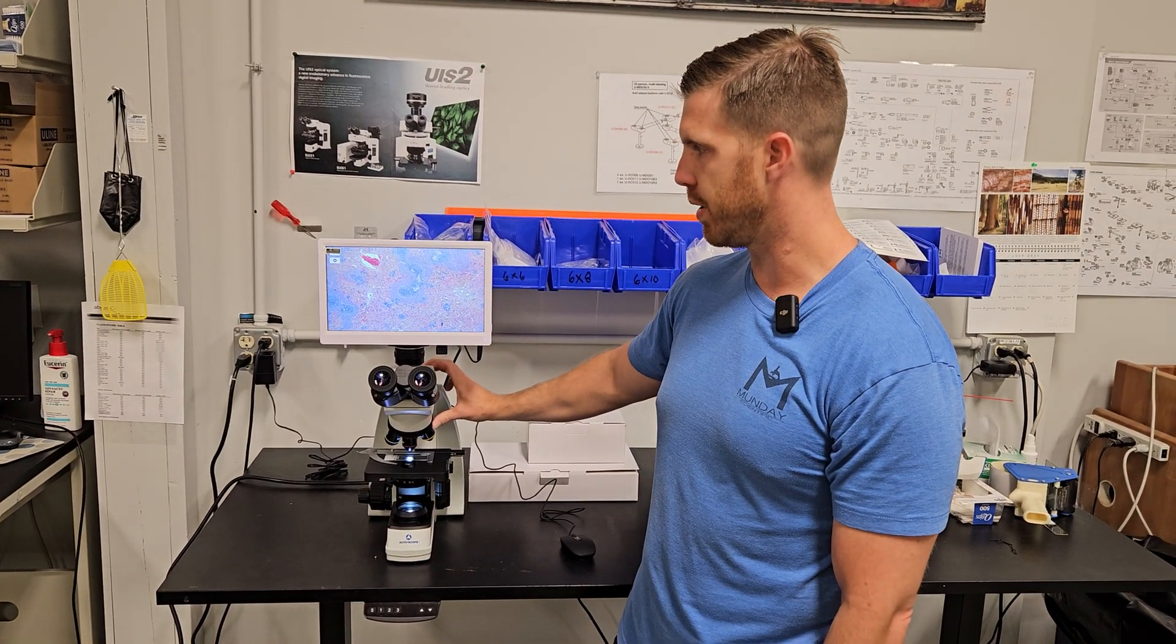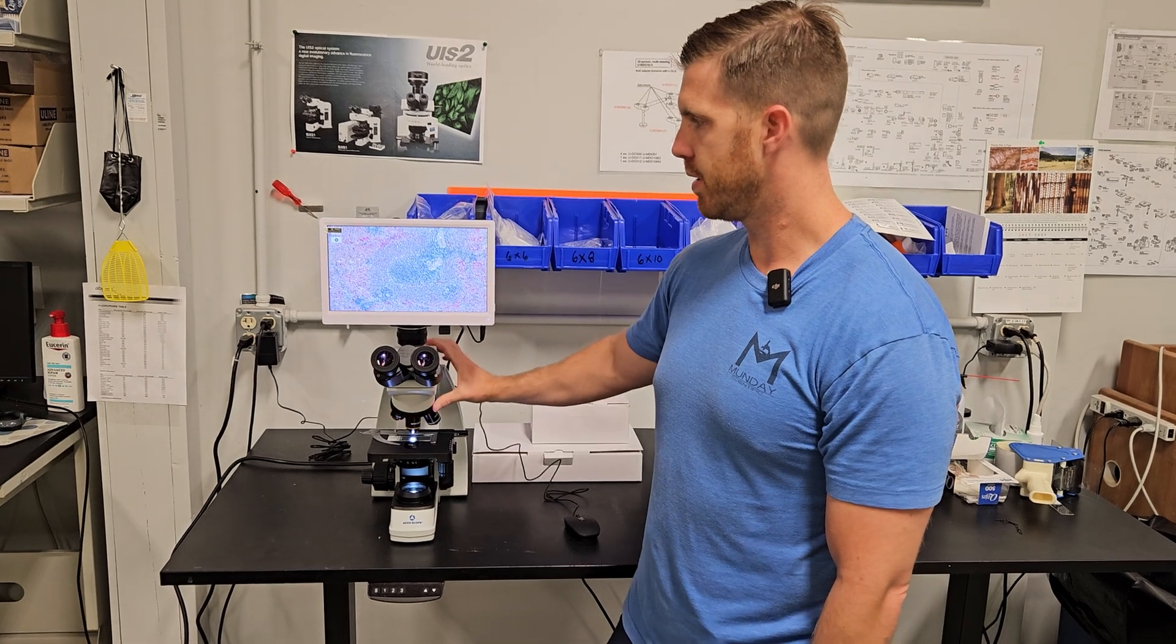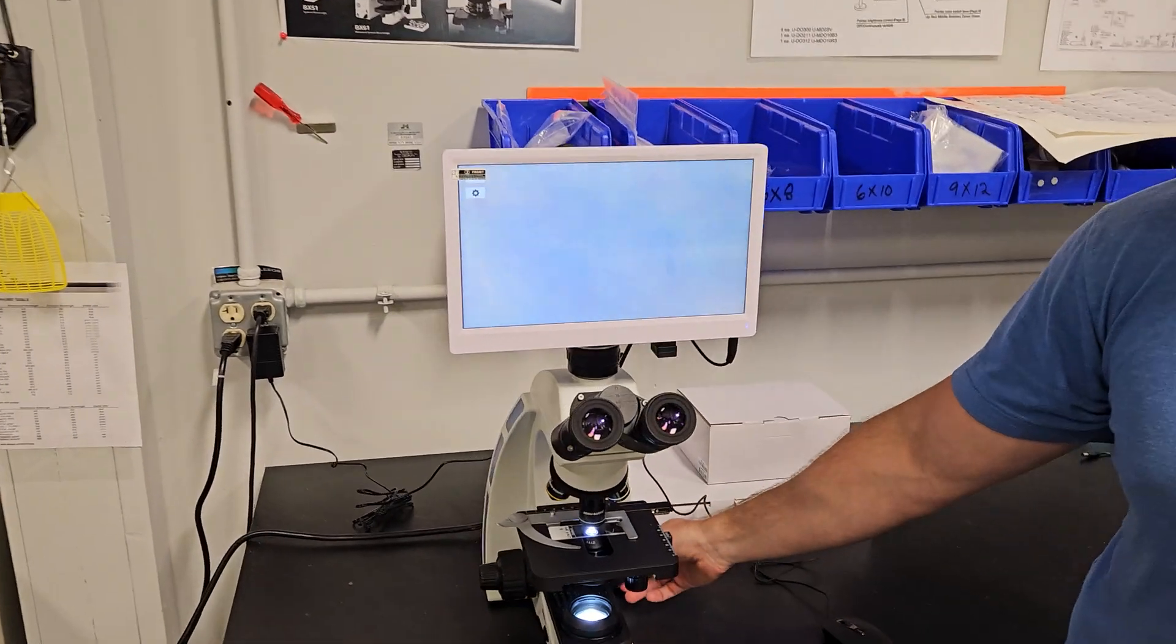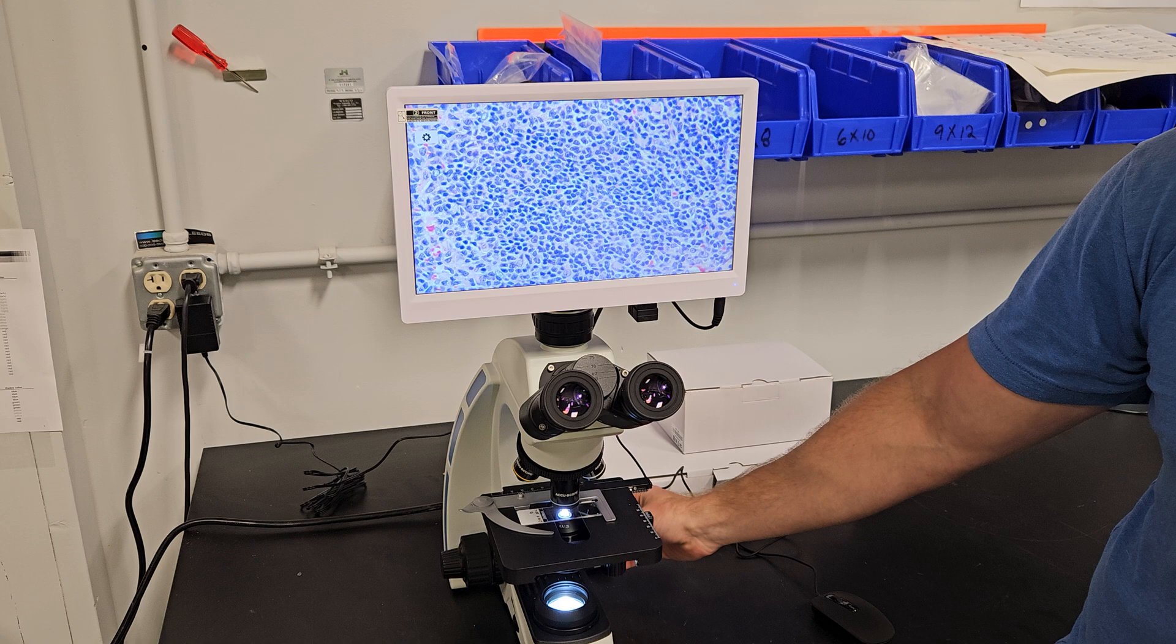It's very responsive so when we move the objectives it's going to catch up very quickly. It's a little out of focus there so we're going to bring it right into focus.